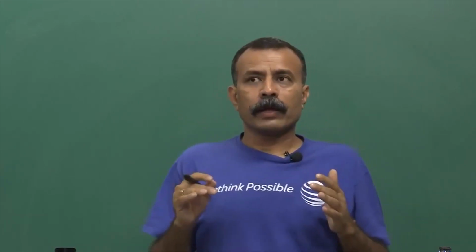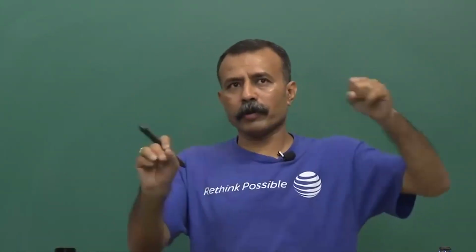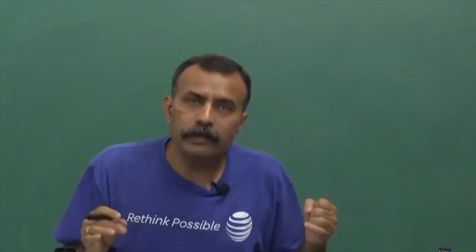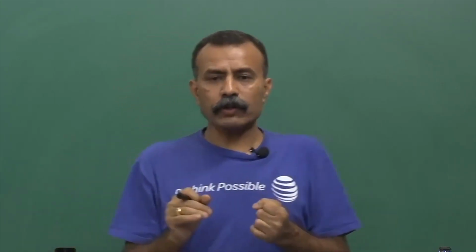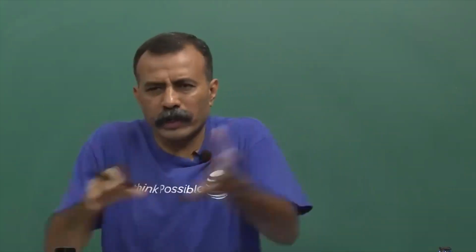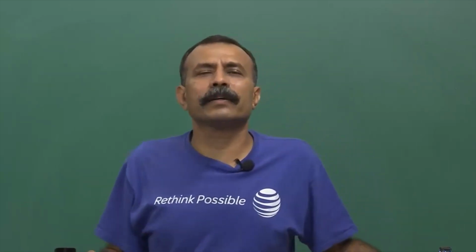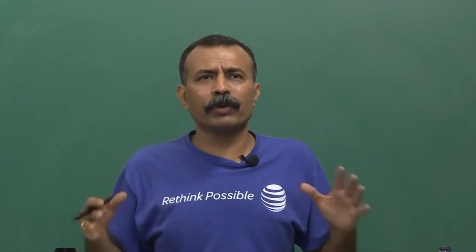Okay. And there are people who are very good, who can tell you that if you put it here, this will be a problem. They may not know your science, and they do not need to, but they can give you better insight into how you can design the whole thing. What I am trying to tell you are those rate limiting points which most of the time we miss out, and then we do some hanky panky job, fit things like that, and that is really a bad design, a bad way of putting things together.